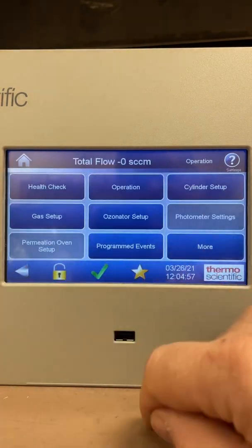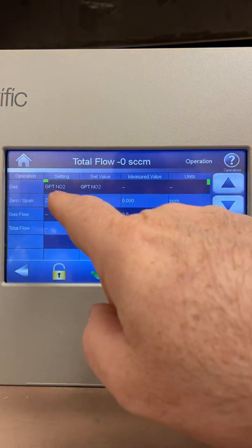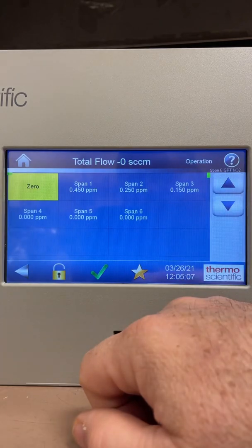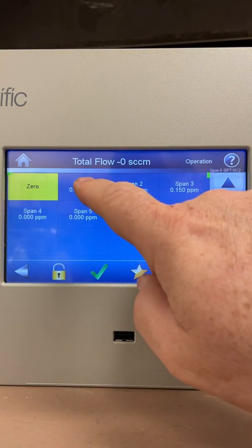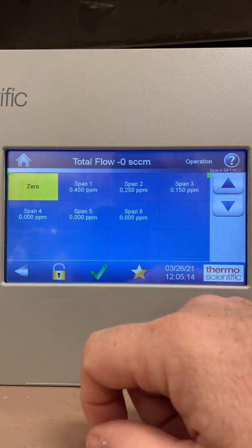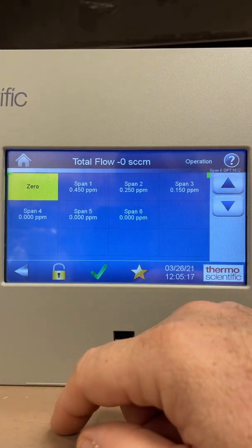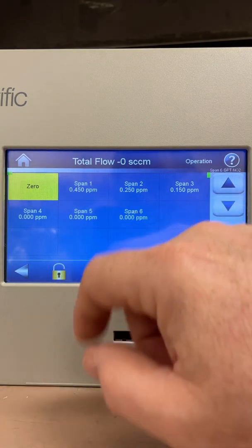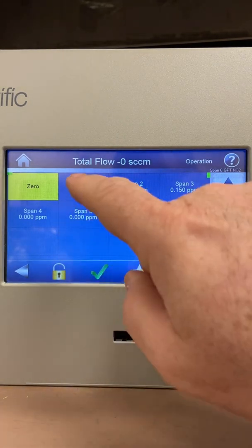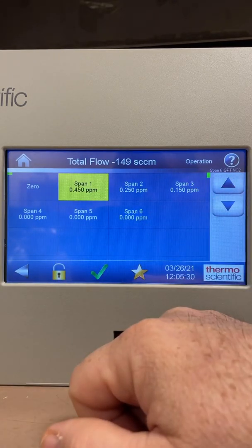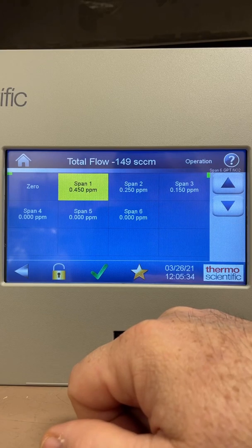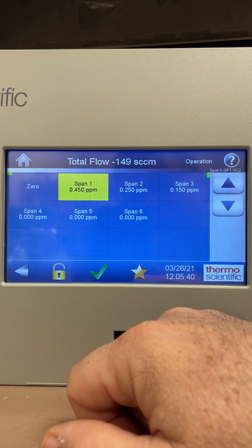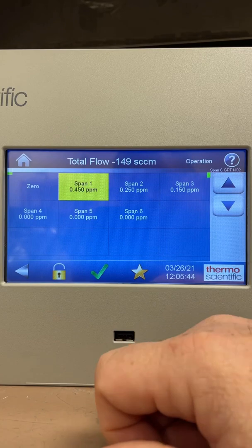Go back into Settings, then Operation, and there it is again — GPT NO2. Currently running zero air. If I pick span 1 as my high point, when I press span 1 you'll hear two clicks: you'll hear the valve for my NO tank and the valve for the ozone generator click as well, since it's mixing ozone with NO to make NO2. When I hit span 1 — there they are — it opens my NO tank at the back and generates ozone into the mixing chamber to make the NO2. Running that for 15 minutes performs my GPT.